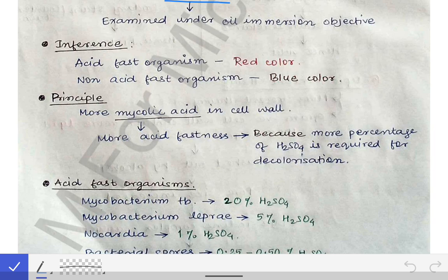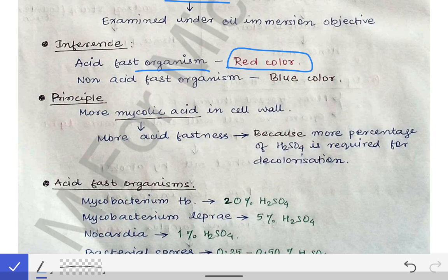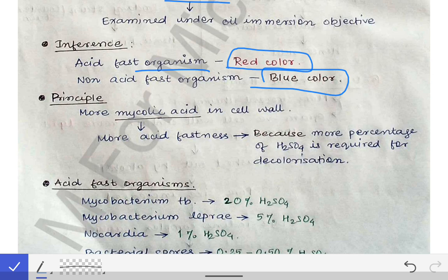After air drying, the slide is examined under the 100x oil immersion objective using cedarwood oil. The inference is as follows: if red-colored bacteria are seen, the organism is acid-fast; if blue-colored bacteria or cells are seen, the organism is not acid-fast. Red = acid-fast, blue = not acid-fast.